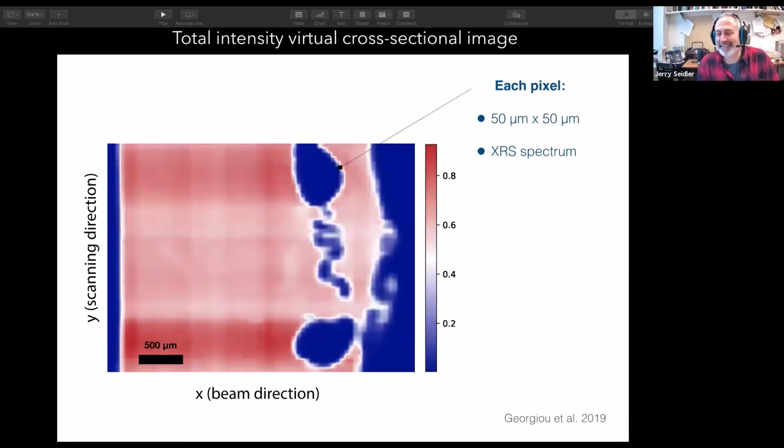It's okay, 50 micrometers. Yes, there are improvements. We have an algorithm introduced by Alessandro Mirone, Christoph Sahle, and Simo Huotari that improves the spatial resolution, and we performed this algorithm on this data set, but at the end we decided to go with the 50 by 50 micrometers.